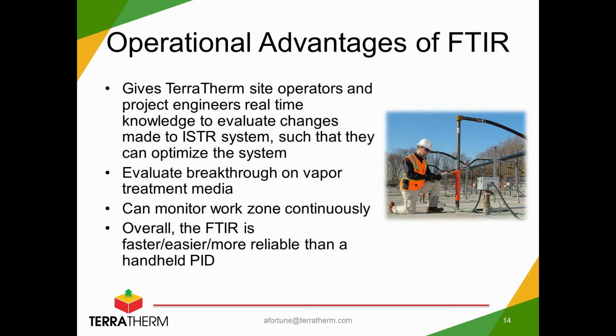And obviously, it was much faster than if we were to collect laboratory samples and send them off for analysis, where we're waiting a matter of days or even weeks for those results. So theoretically, we would be able to evaluate breakthrough on vapor treatment media. We were able to monitor the work zone continuously.